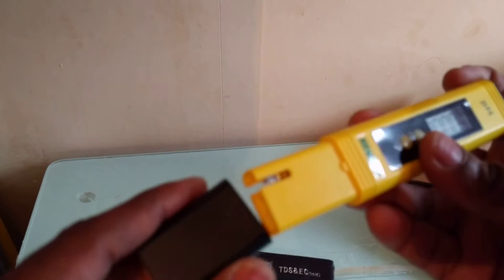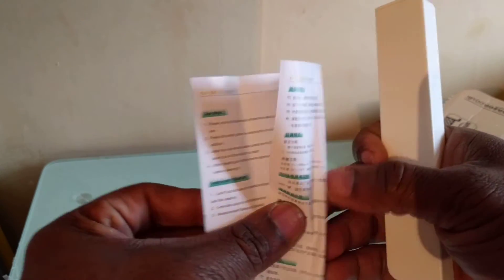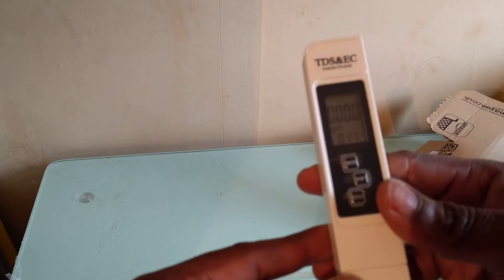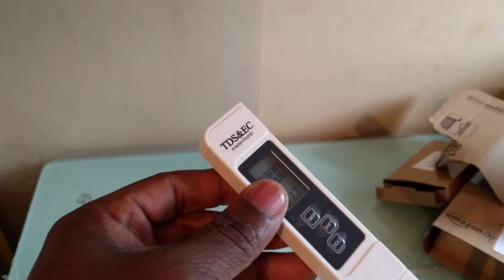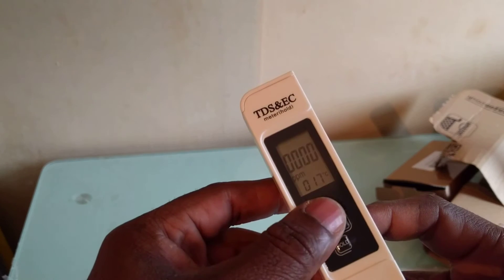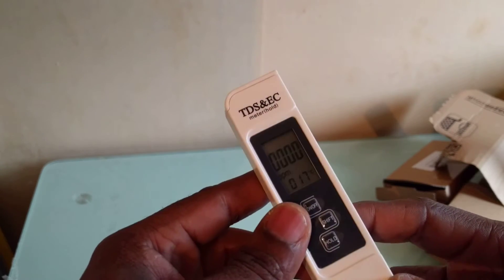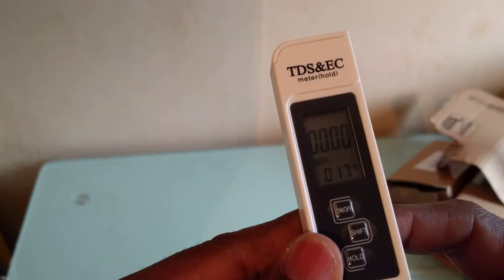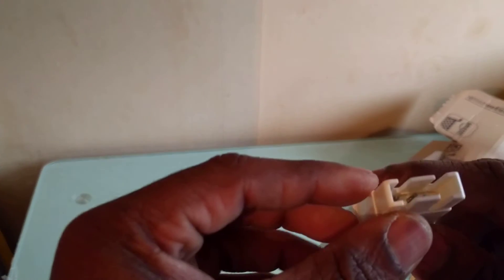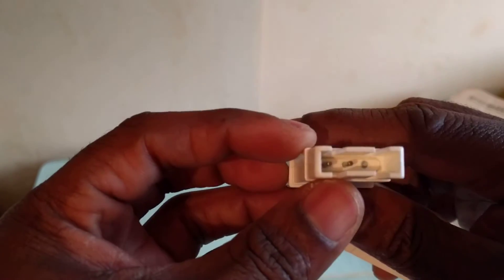Now let's look at the TDS tester. It's got its own manual. Let's switch it on. What this basically does is test the total dissolved solids in water. And it also tests temperature as well — I can see now my room temperature is 17 degrees Celsius. So it tests the temperature of the water as well. We've got two electrodes here.